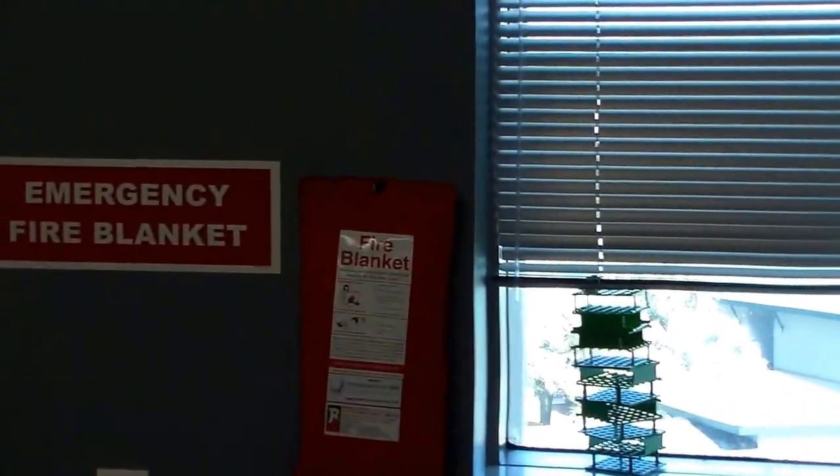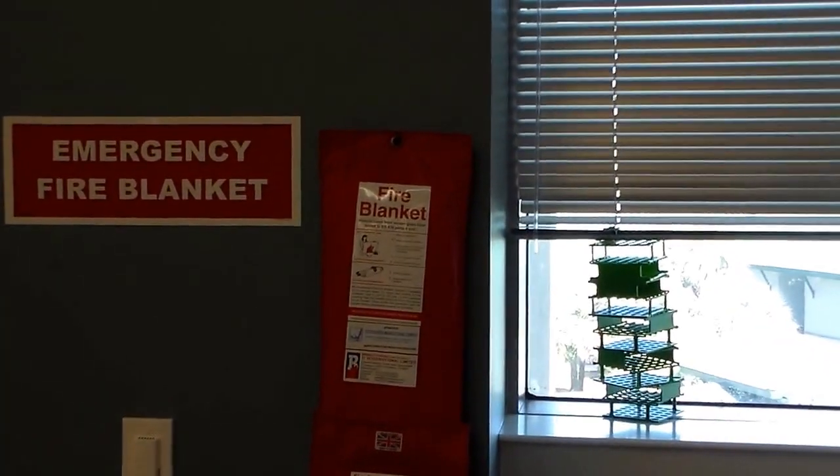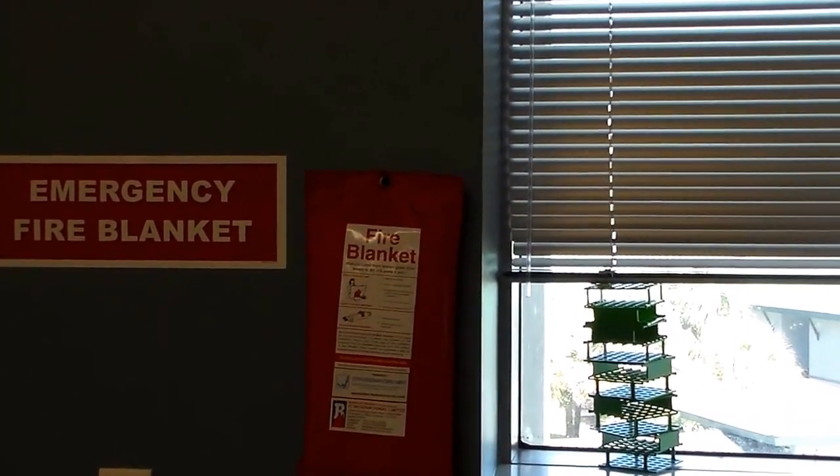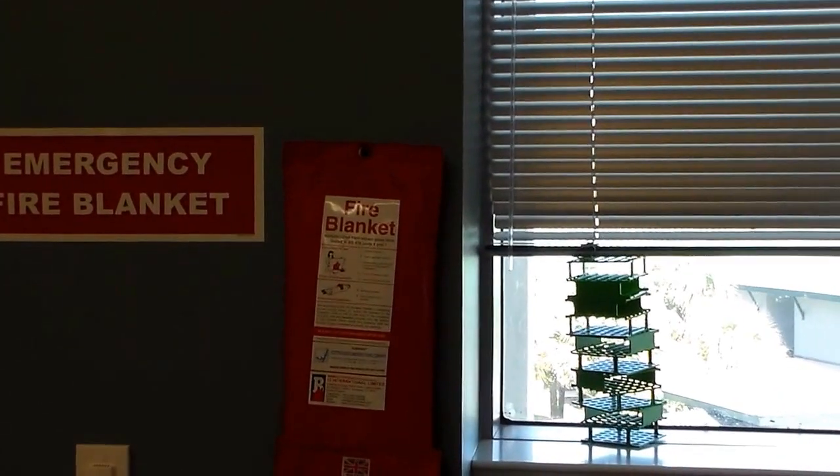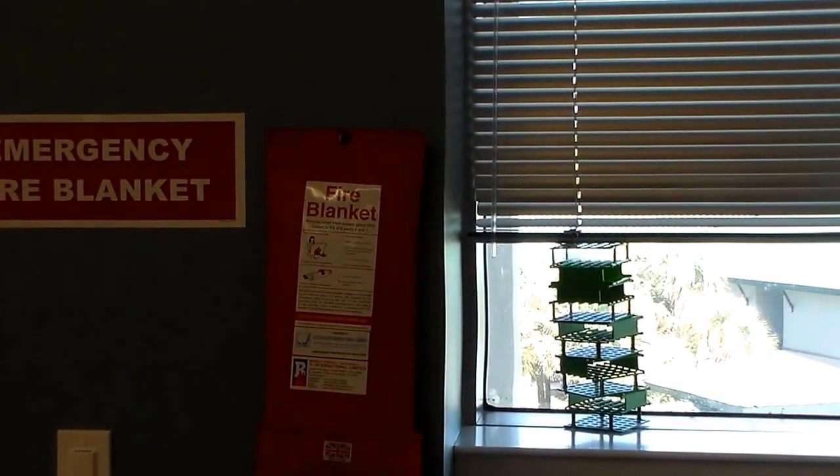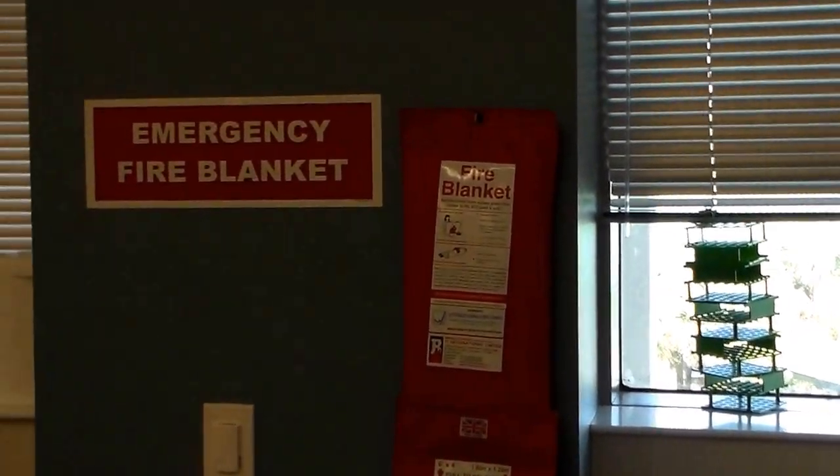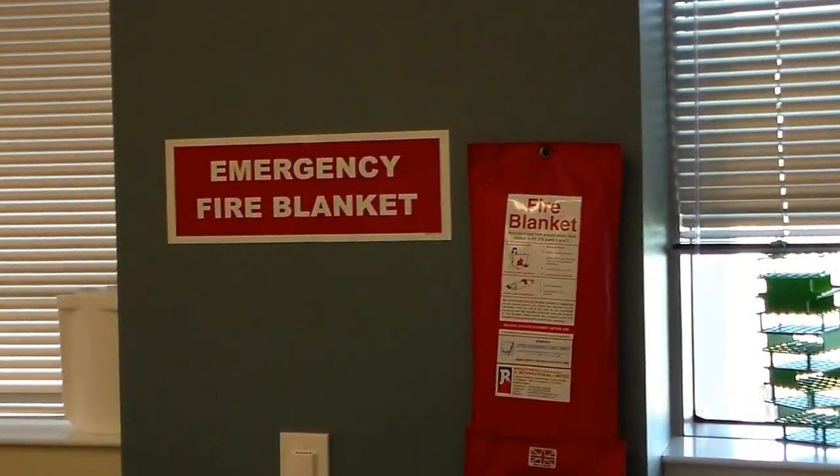Along this back corner of the room we have the emergency fire blanket. That's something that's good to use when you can't get to the safety shower, so typically when you're in this corner of the room or when the chemical reacts with water. Chem 1 won't be using anything that's reactive with water that can't be just treated with the safety shower, so we don't have sodium metal or anything like that that catches fire with water.